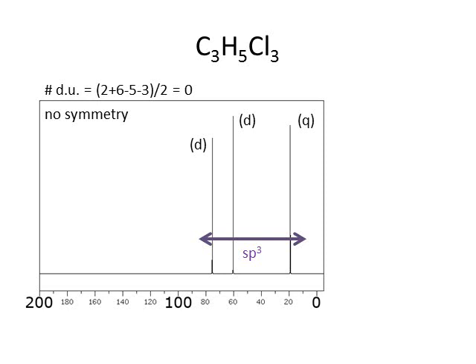But not just sp3 hybridized carbons. Within this region, notice this one is more to the right, and these 2 are more to the left. What did we say about those regions? We said electronegative elements will cause things to shift to the left within those regions. If I look at my formula, I notice I've got chlorine, which is more electronegative than carbon and hydrogen, right? It's the 4th most electronegative element on the periodic table. And that's going to suggest to me that these 2 guys over here are near the chlorine. On the other hand, this signal represents a carbon that is not directly attached to chlorine.